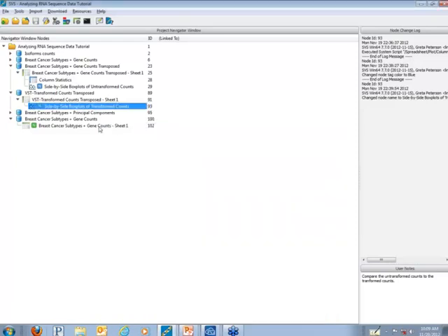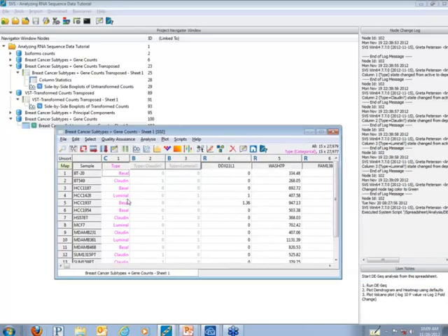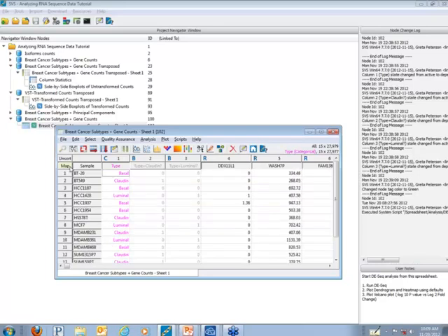Now we'll go ahead and open up our spreadsheet. I'm sure most of you are familiar with spreadsheets in SVS, but just a reminder, here we have a categorical column consisting of cell type, and we have the read counts for the genes in columns 4 on. And we have a green map button that contains the chromosome position, which is really the start position of the gene, the stop position, and the list of transcripts. This is all information that was in the tabularized quantification text file.